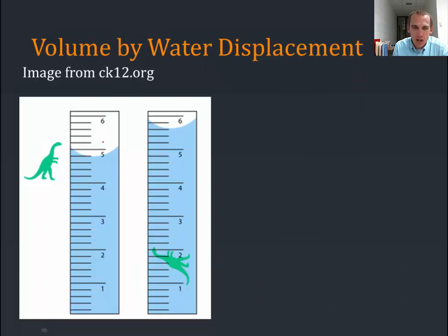This thing right here is showing us what water looks like in a graduated cylinder. You'll notice it dips down. This is called a meniscus. We measure to the bottom of the meniscus.